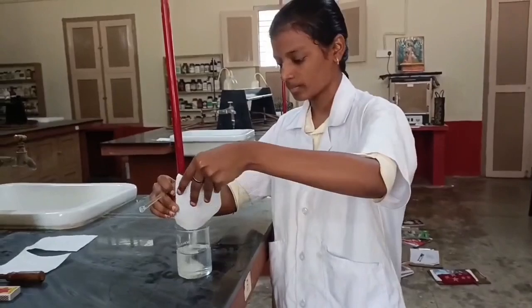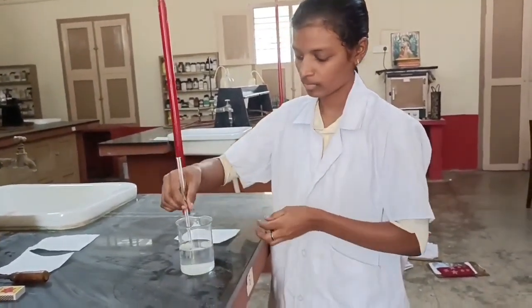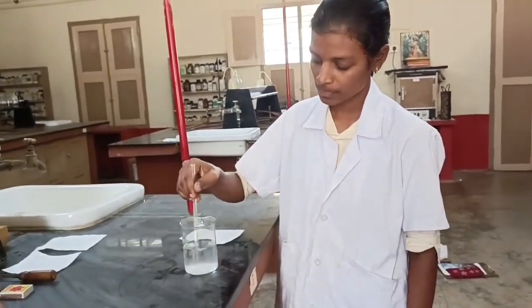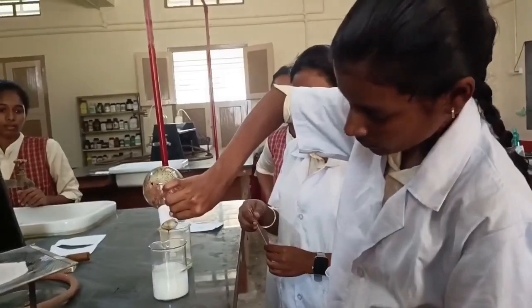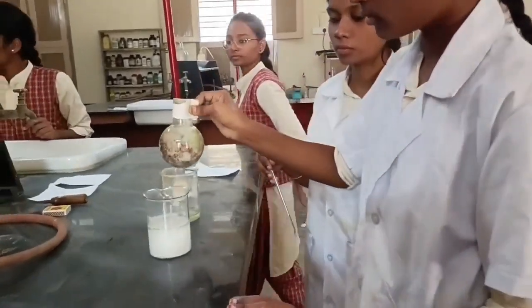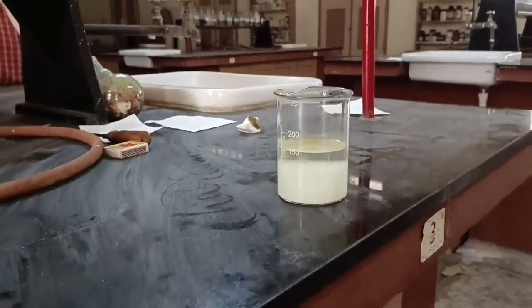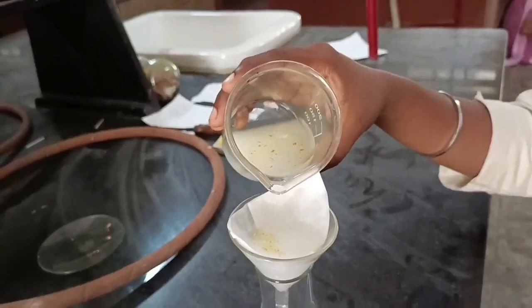Meanwhile we are making a sodium sulfite solution. A clear solution of sodium sulfite should be prepared before mixing the reaction mixture into it. We are making a clear solution by stirring with a glass rod. Next we are adding the reaction mixture into this sodium sulfite solution. You can see the formation of a white color precipitate in the container, and this precipitate slowly settles down if you keep it aside.